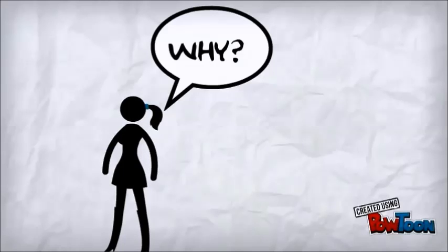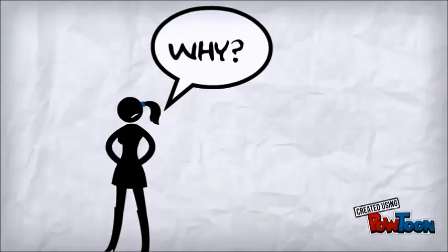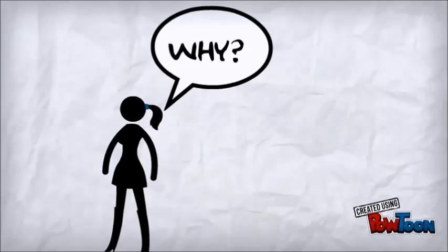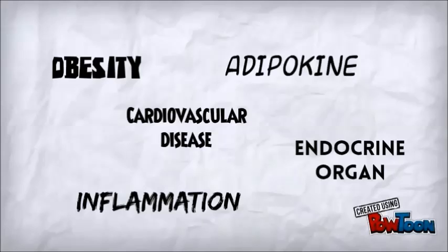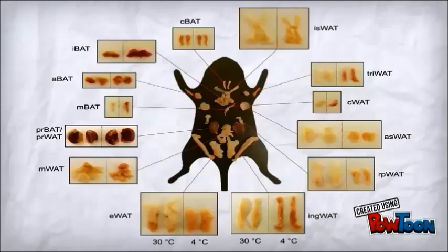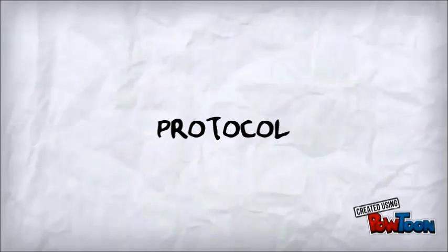This is because adipose tissues are widely used in research that needs deeper understanding of dreadful diseases such as obesity, inflammation, cardiovascular diseases, and many more. This diagram shows the parts of the body from a rat that we can get adipose tissues from. How to culture adipose tissues?